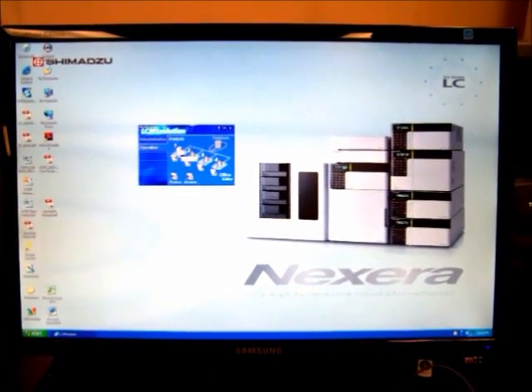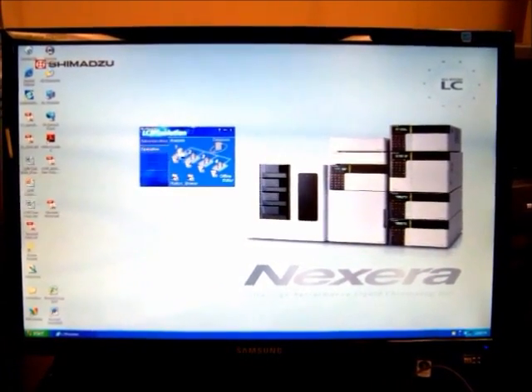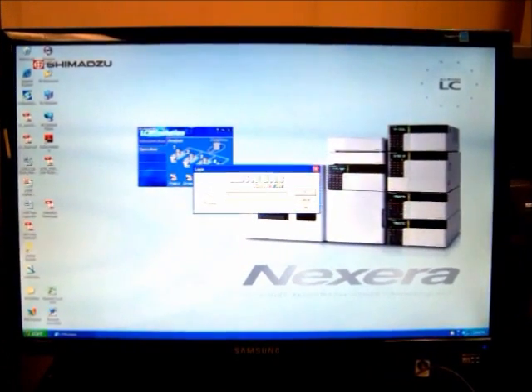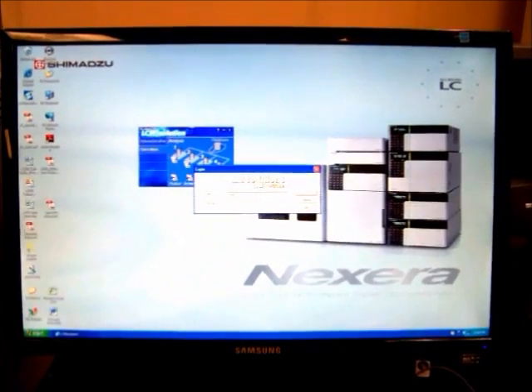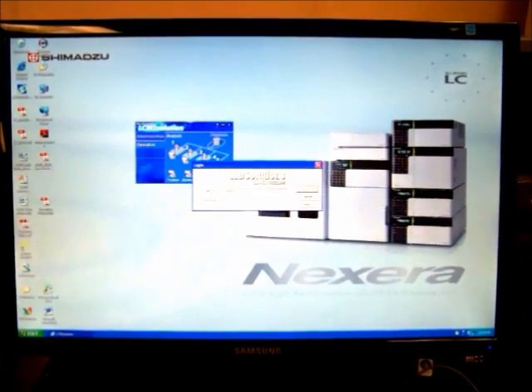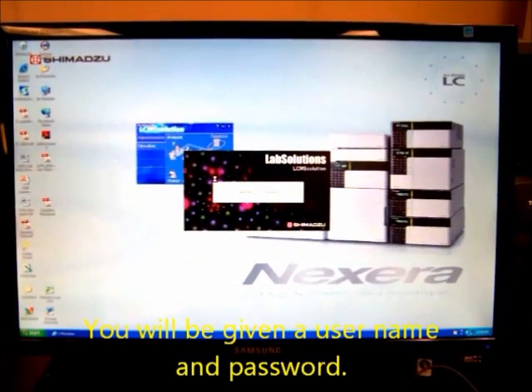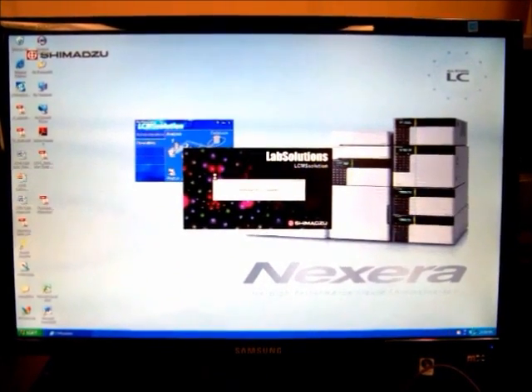What we're going to do today is an HPLC-MS run, a traditional LC-MS. So we're going to click the first icon. You'll be prompted for your user ID along with your password. The HPLC will beep, meaning that it's talking to the computer.